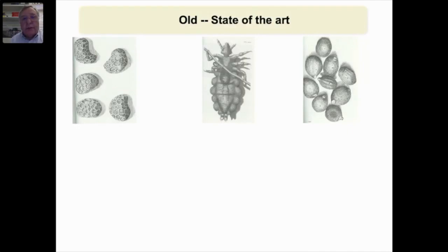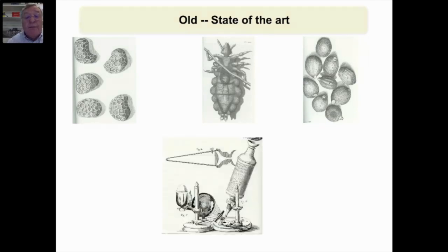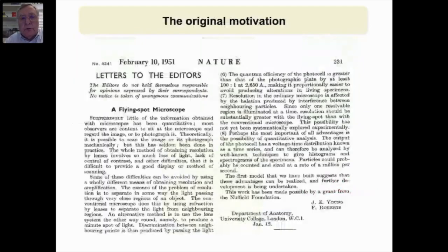And so here are some images I scanned from a book in the Oxford Library. Three-dimensional, very nicely produced bits of, I don't quite know what, pollen grain, some sort of bug. And so the issue is, which instrument took these images? And the answer is this one. And these images were, of course, recorded by Robert Hooke in 1665 or thereabouts. Now, fairly clearly, this is not what he saw, but he was able to reconstruct from what he saw these really rather impressive images.